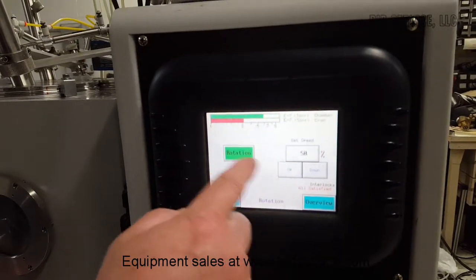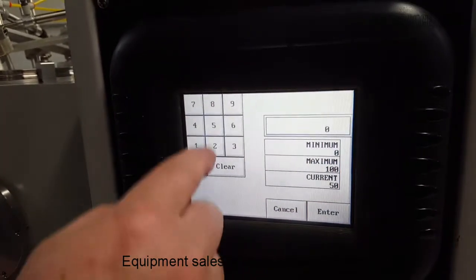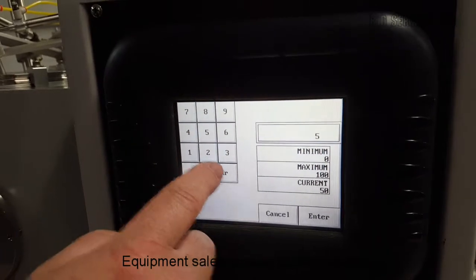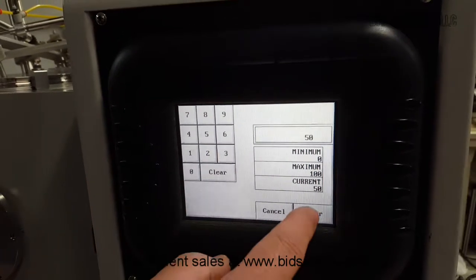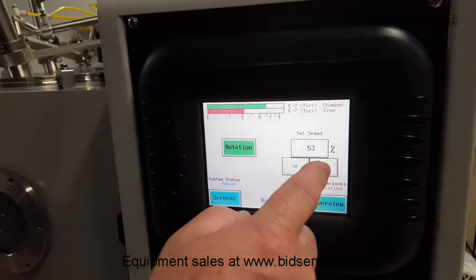Over here you've got rotation. I've got rotation turned on and it's around fifty percent. You can just hit the buttons and change whatever you want, or do it by using the up and down controls to adjust the value.